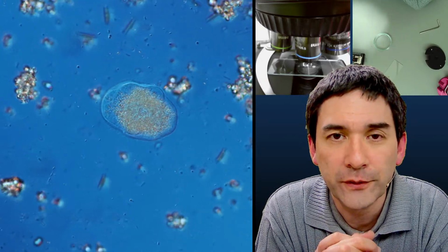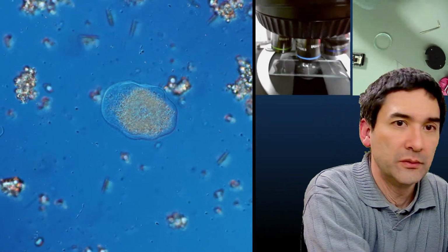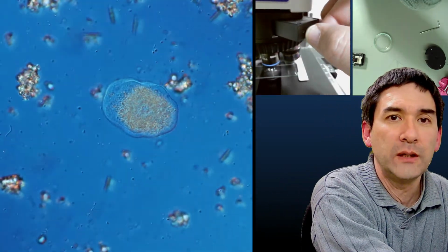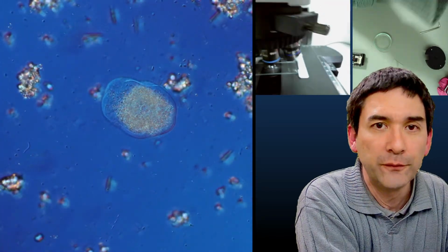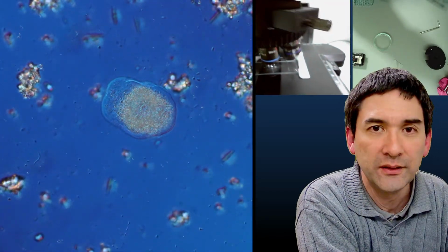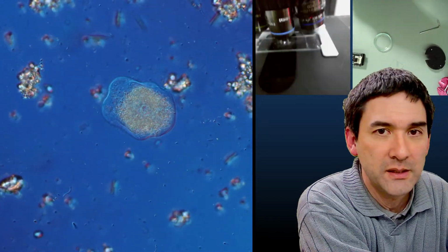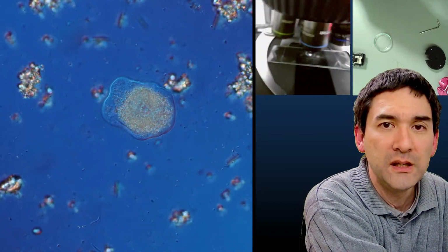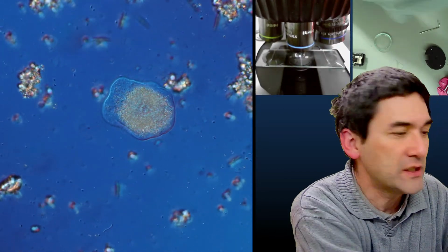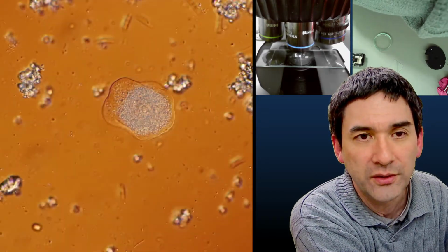There are different brands of microscopes where you have to take the slider out. I can show you. You can actually pull it out, and you have to replace it with a different one for a different objective, and I didn't want to do that. So I'm always leaving it in there, and basically this allows me to do simple, easy microscopy without having to exchange the slider. The only thing is that I'm turning it, and then I can adjust the colors as I want.